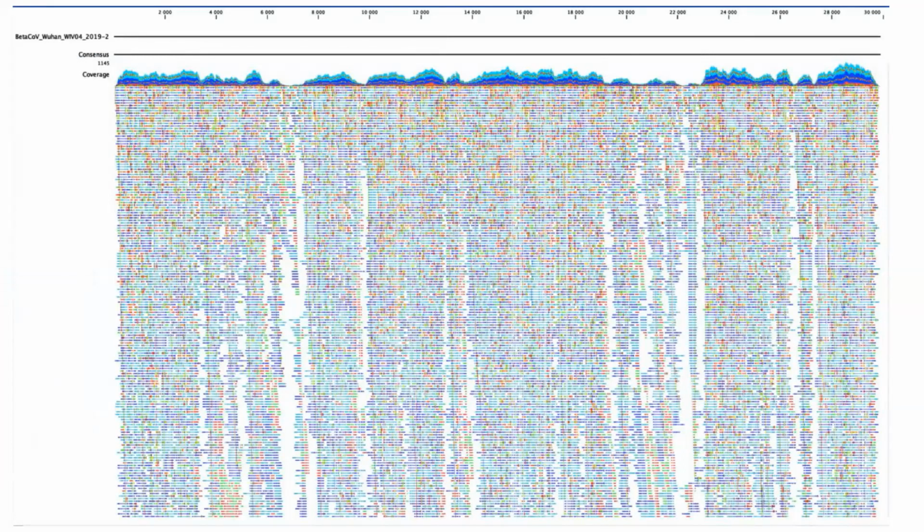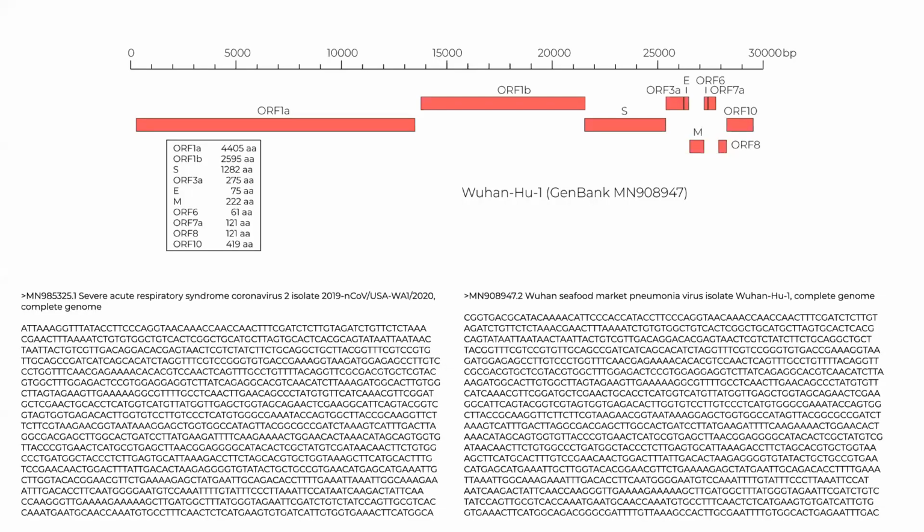In the end, when they are processed and mapped correctly onto the reference genome, we actually get the FASTA sequences that you are already familiar with that we talked about last week. So those FASTA sequences are the consensus sequences if the data originated from next generation sequencing.